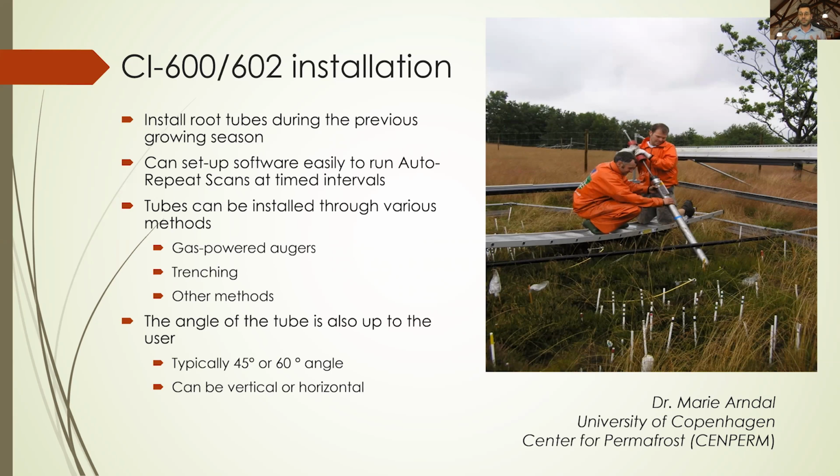Now, plant by plant, it's going to be a bit different, of course, with your growing season. Some plants are very fast, rapid growing. Some plants, like when dealing with a poplar tree, have root issues.